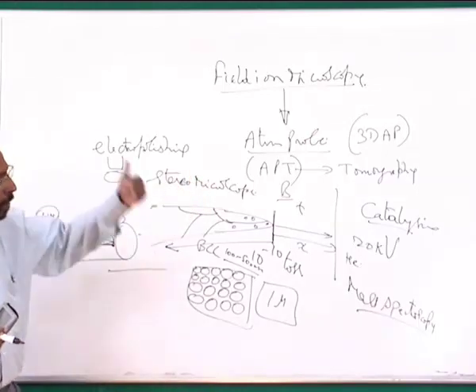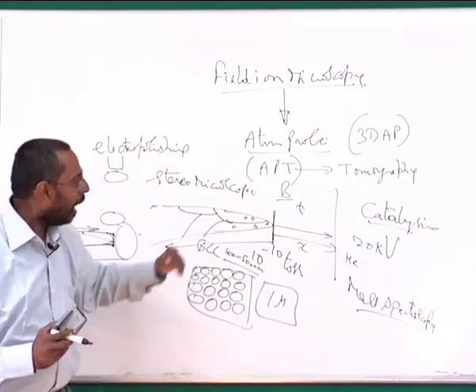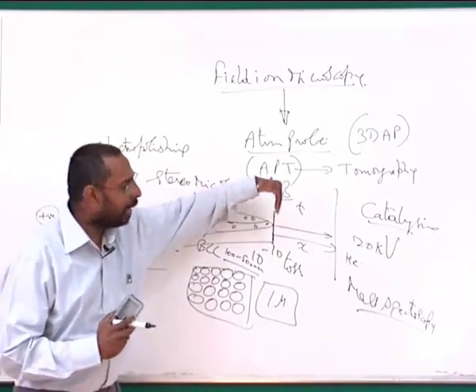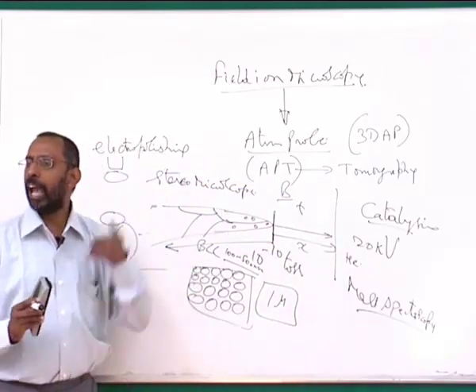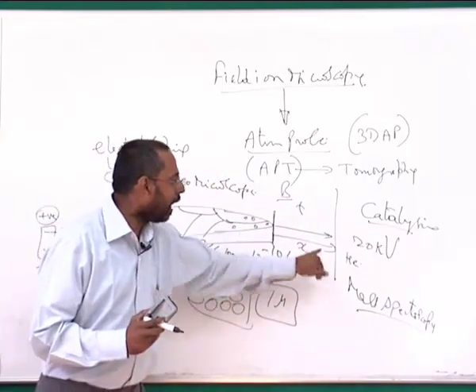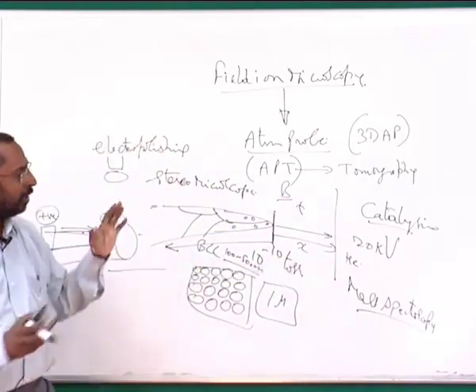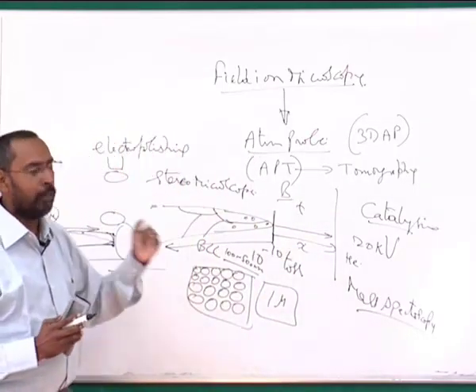So one by one, layer by layer, pulses are given like that. And as you give a pulse, one layer has gone, so as a result the distance has changed. So you have to recalculate the whole thing and find out again the times with respect to the distance. So the distance has to be accurately found out, and that is how we will be able to do it.